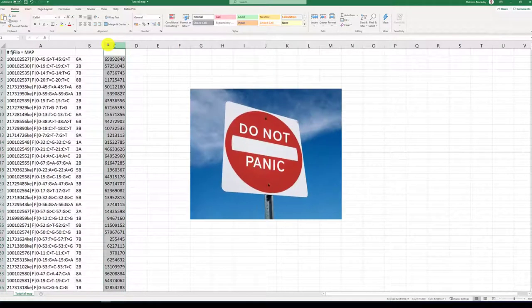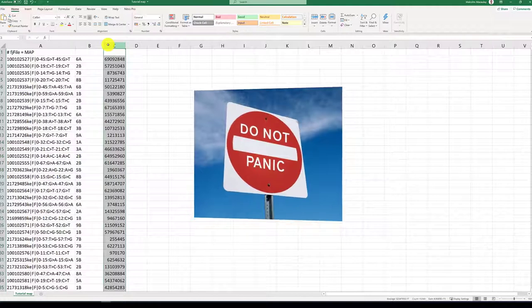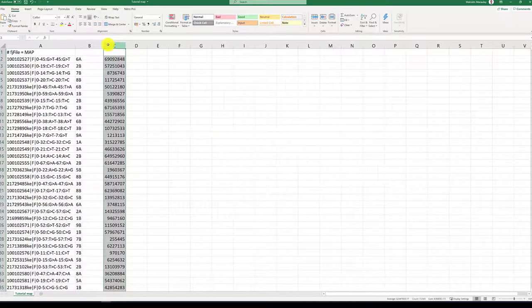Don't panic if your chromosome and locations aren't in order as Flapjack will do this for you.